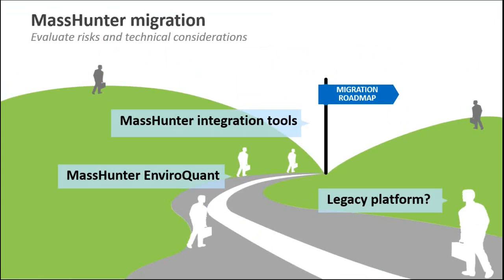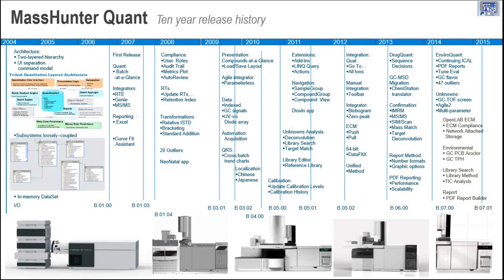So the migration task. If you're on a legacy platform, I'm going to talk about MassHunter EnviroQuant, and I'm going to talk about the integration tools and the migration roadmap that would lead you in that direction.